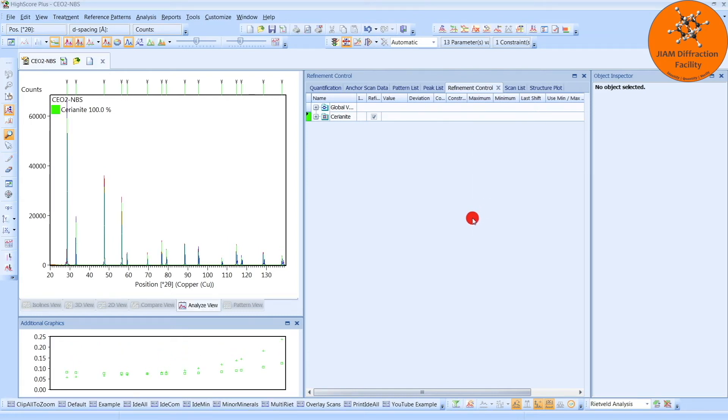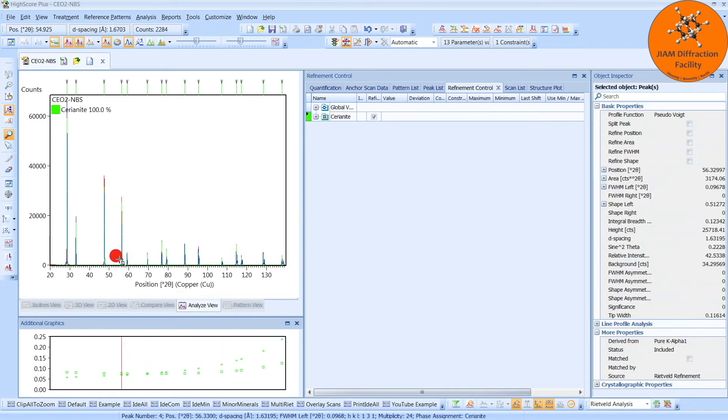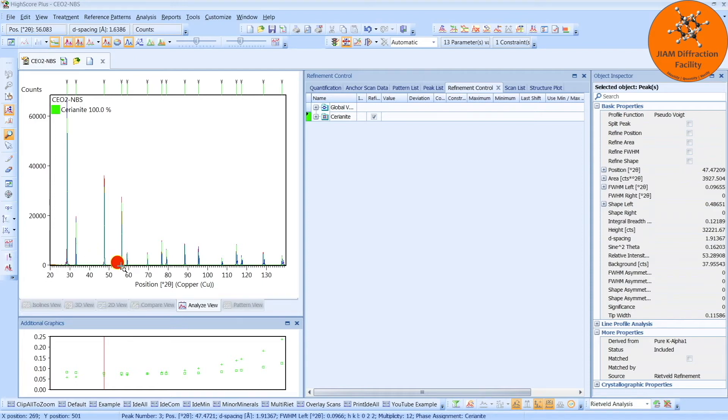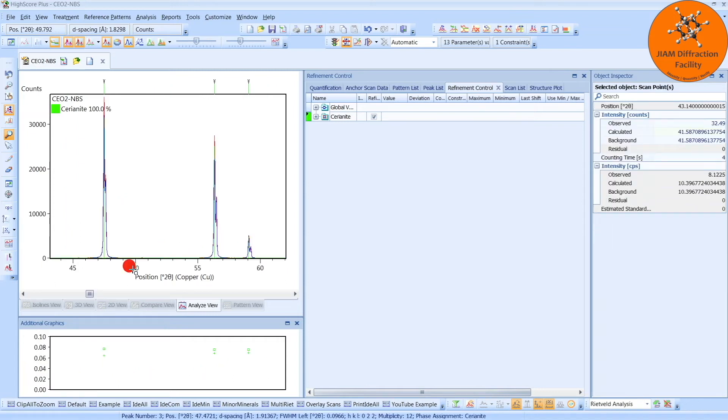Now that that's done, I want to look at one additional factor, and it involves the low-intensity region around some of the peaks. I'm just going to pick these three peaks for example, and left-click and draw a zoom box.